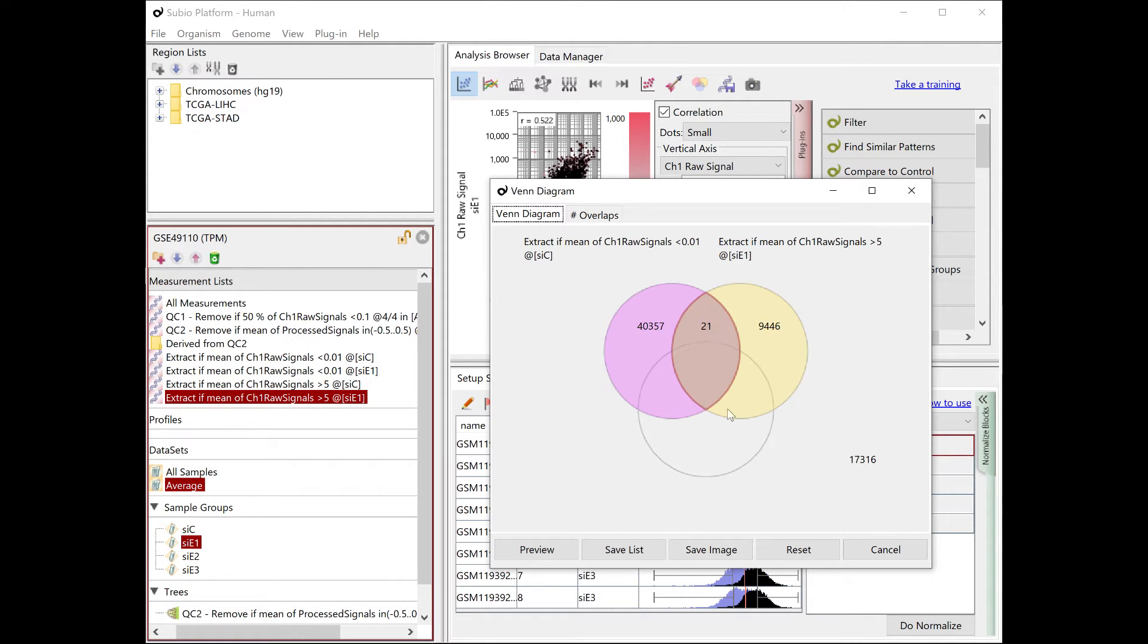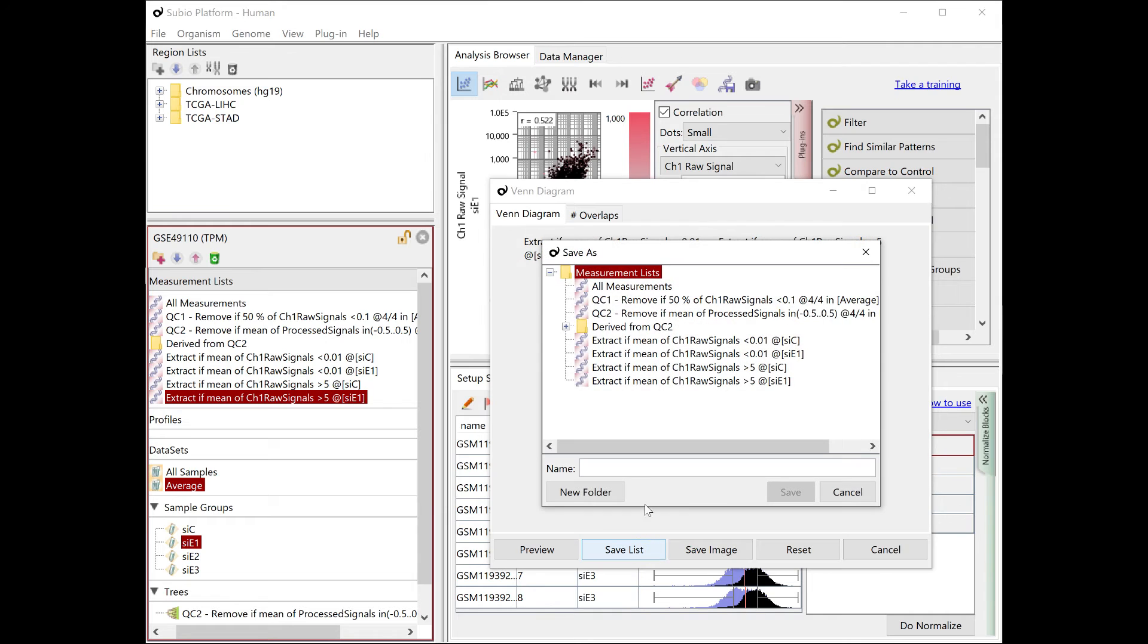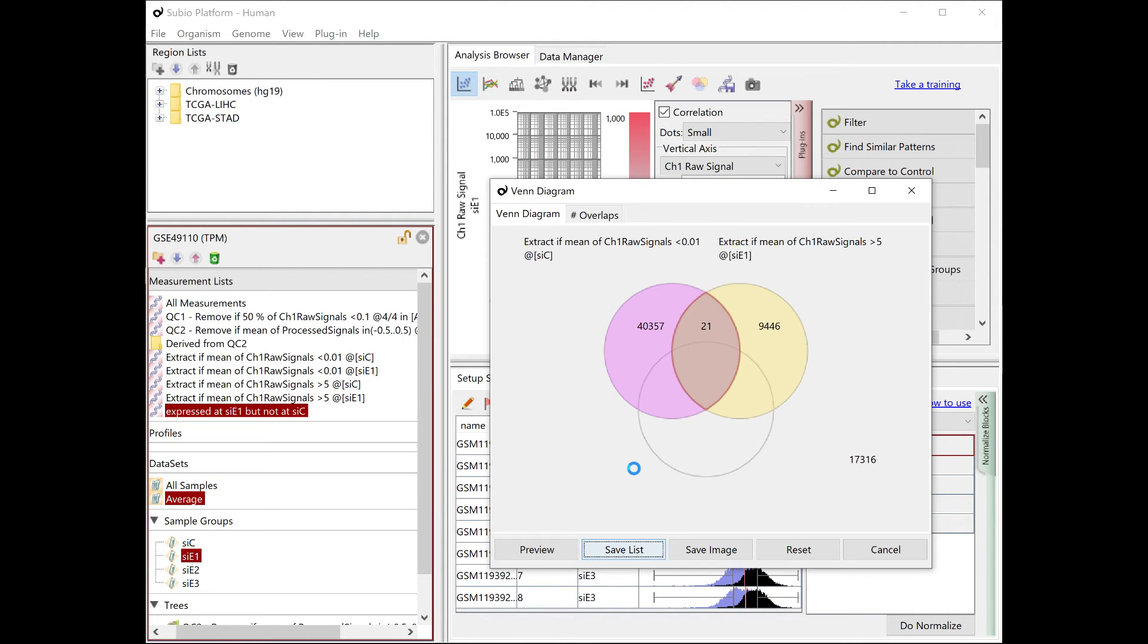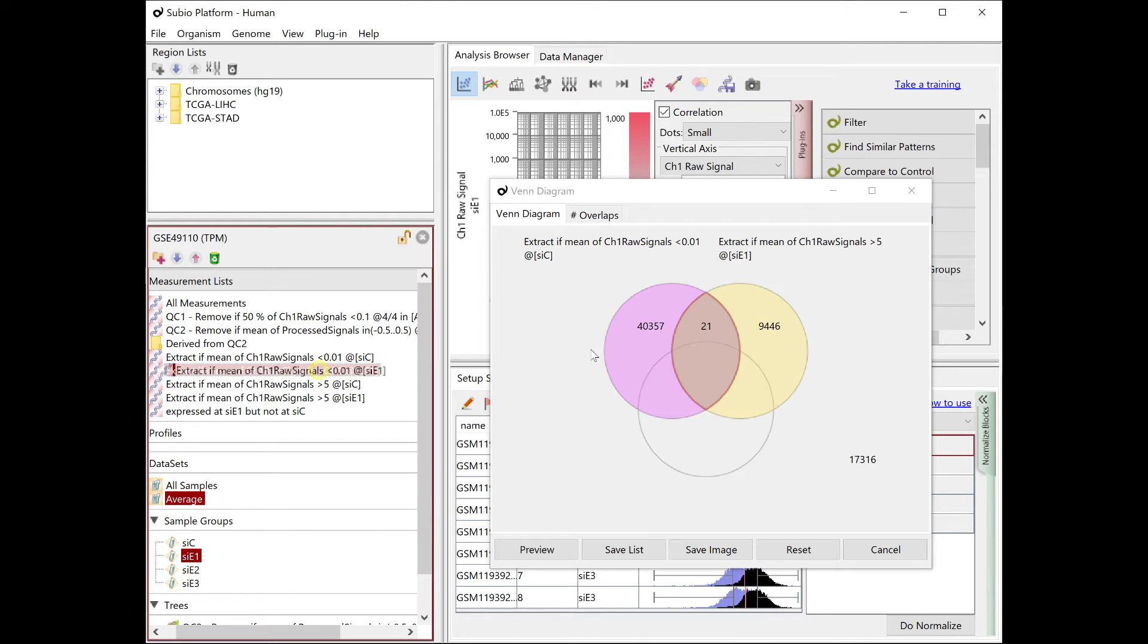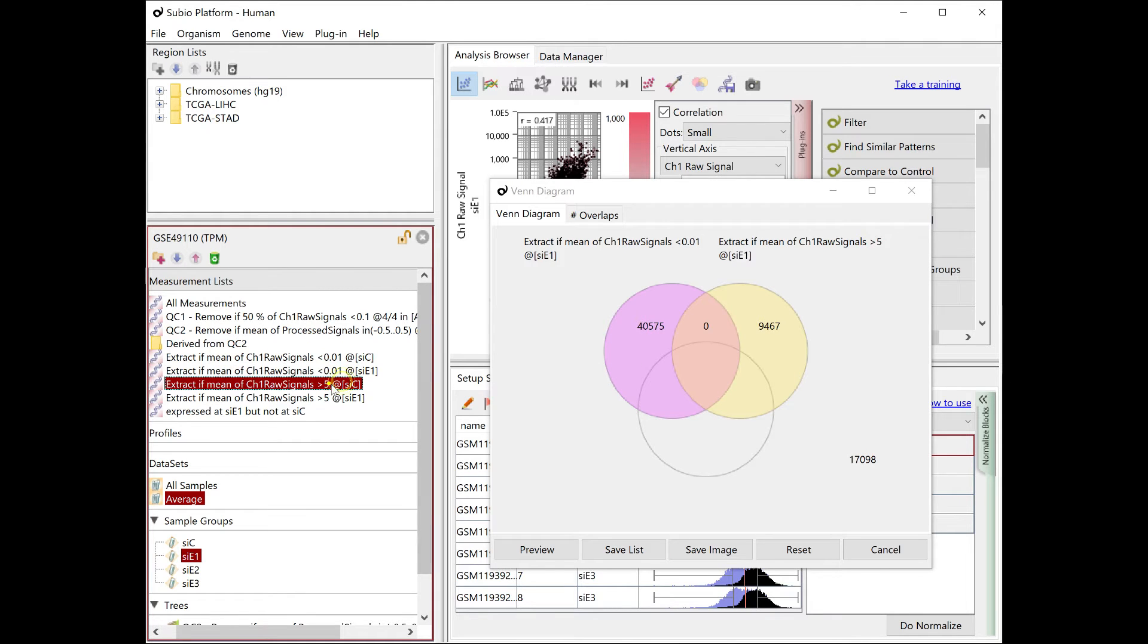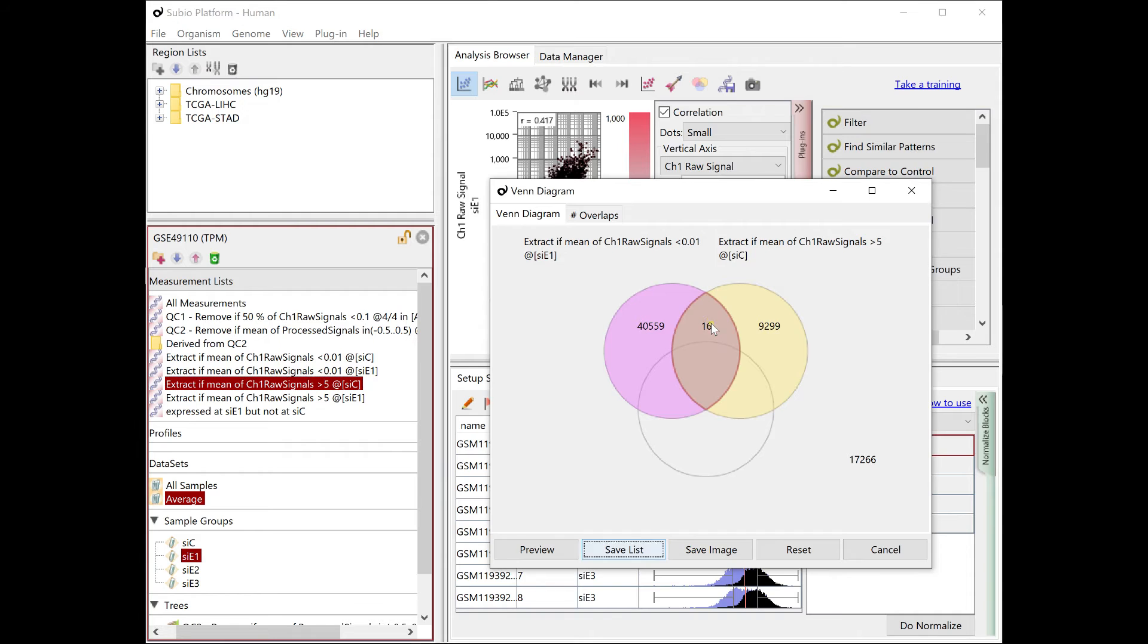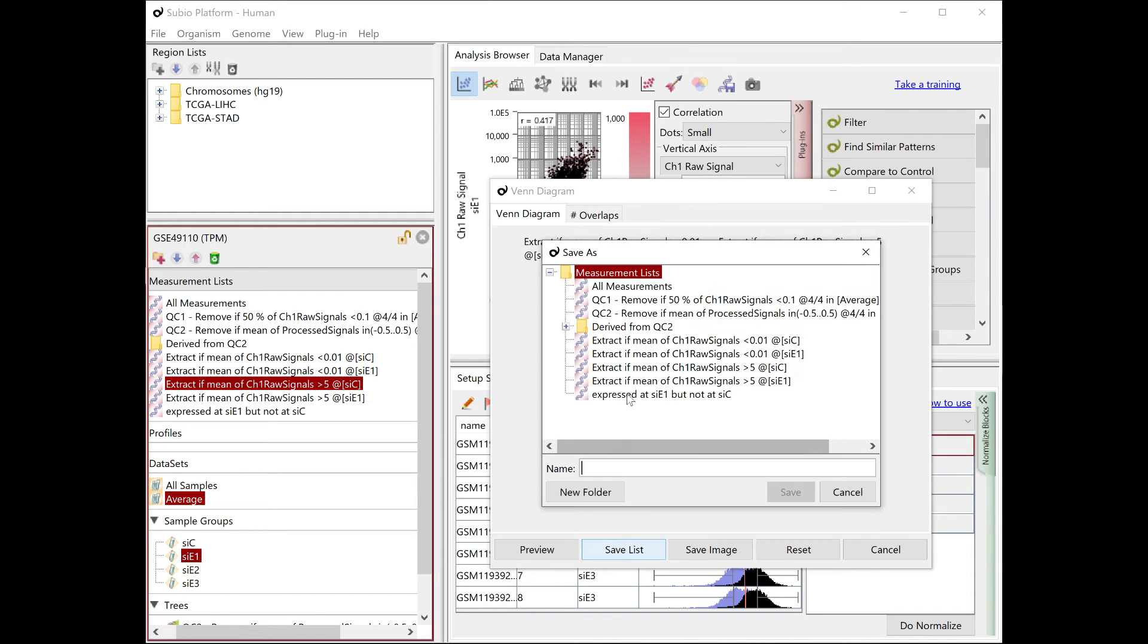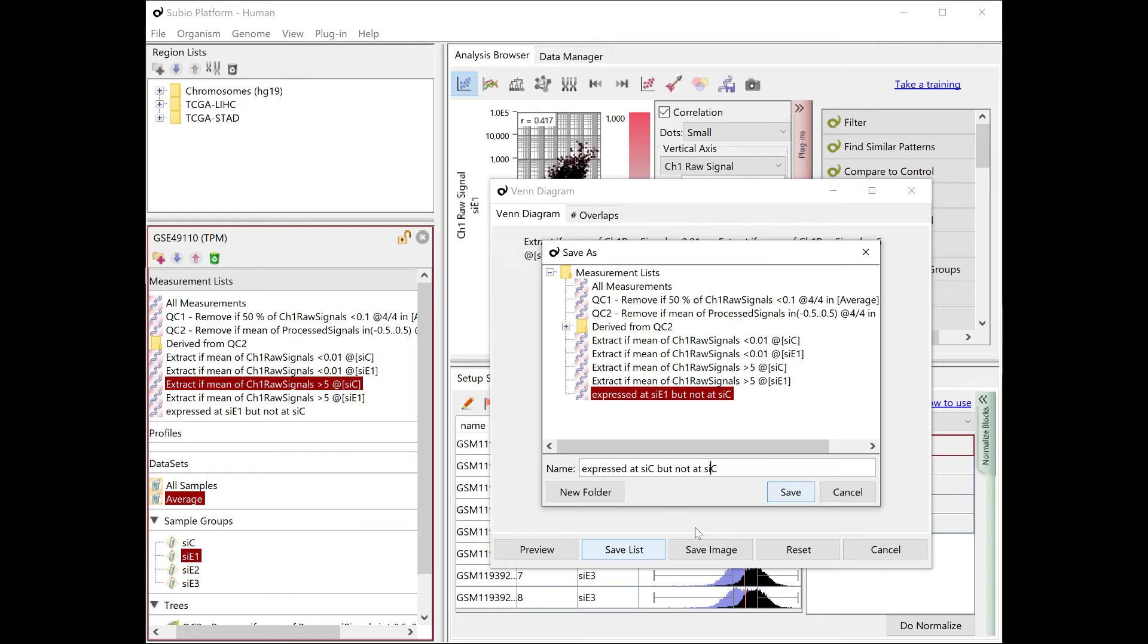Now, combine the list of expressed at CC and not expressed at CE1. Save the list of the intersection.